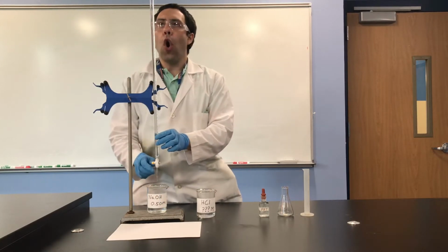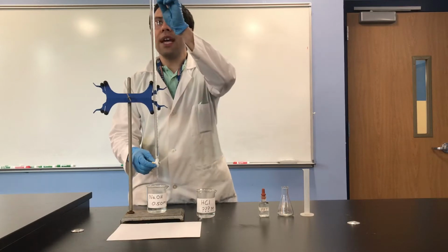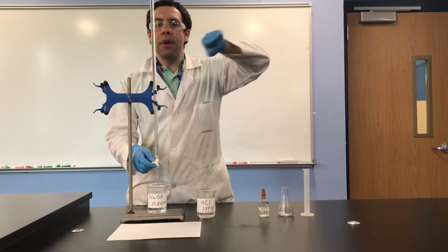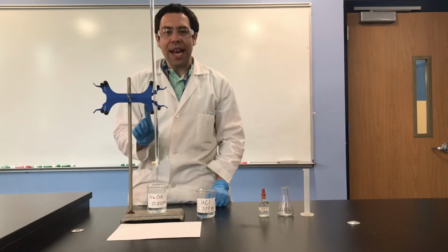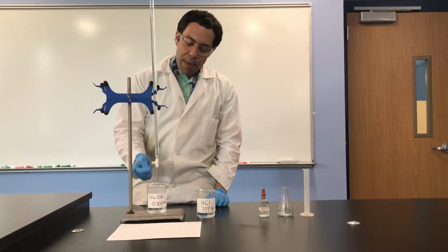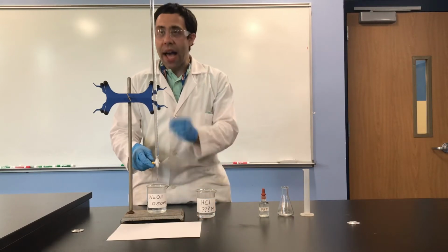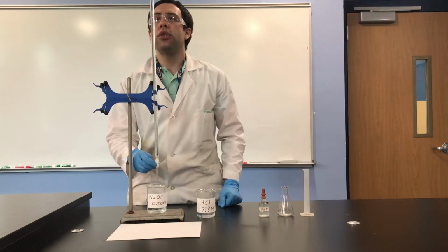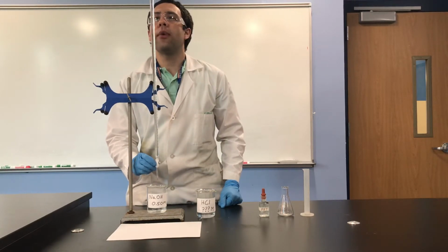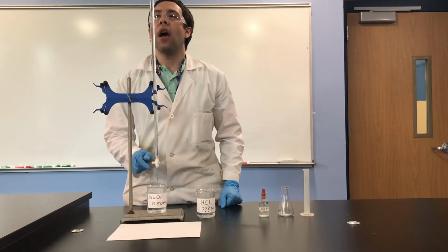Now I'm going to open the stopcock so that I can slowly drain the base down so the meniscus is touching the 0 milliliter mark. The reason I do this is there might be some air bubbles in the stopcock, and by filling it up higher than 0 and then slowly draining it down to 0, we can ensure that we have the proper volume of base inside of the burette.